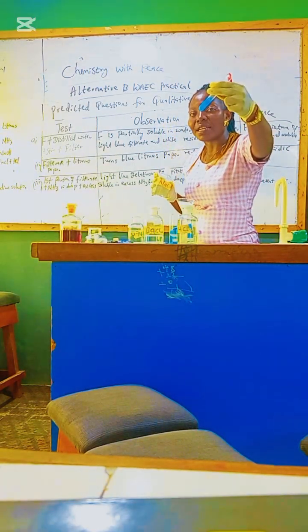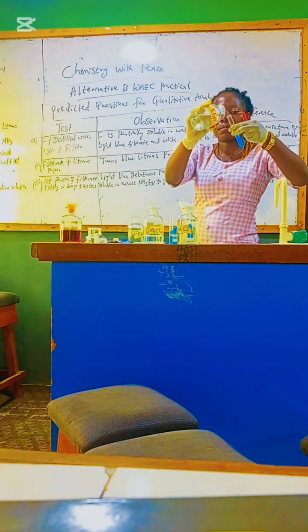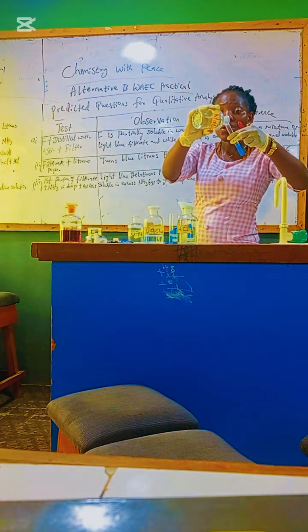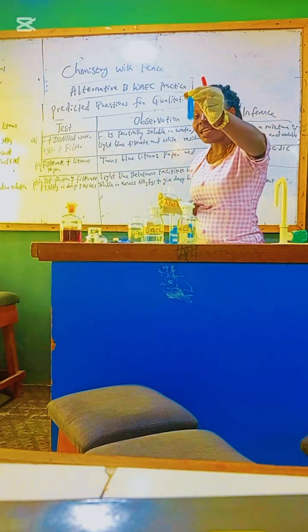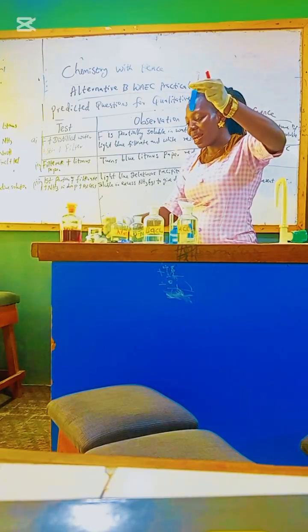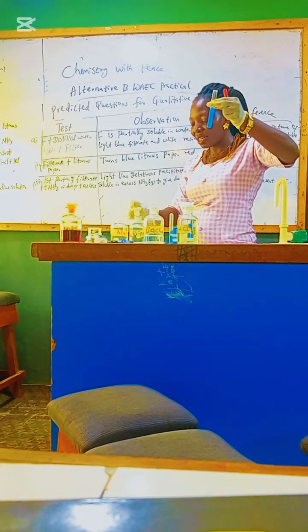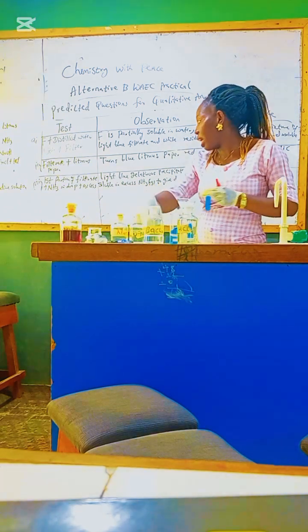Light blue gelatinous precipitate in drop. Insoluble in excess. Look at it very well, it's still not soluble.